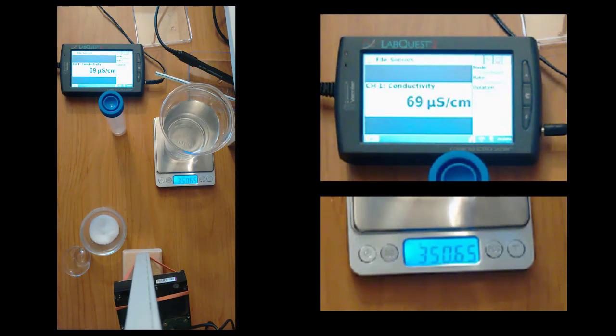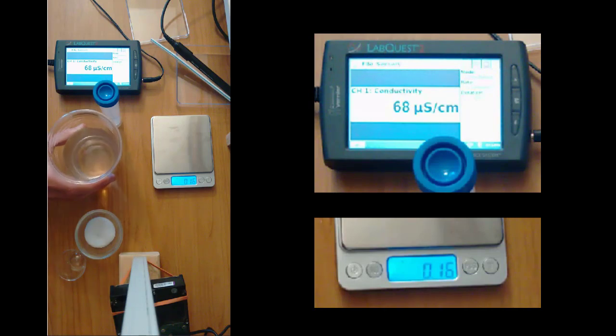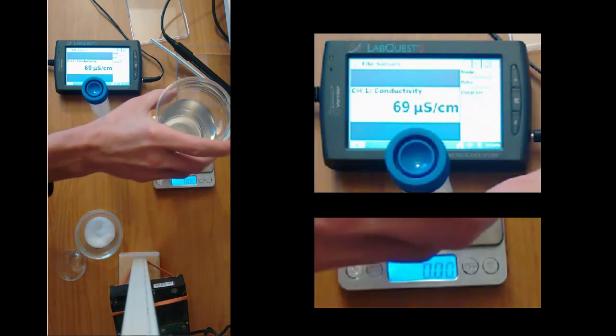Okay, that completes the data collection for the filtered tap water. We do have one more trial to do, and we're going to analyze a sample of distilled water as a control experiment. And for our last part of this experiment, we're going to be looking at distilled water. So this is my sample of distilled water. Again, I'm not going to talk too much during the experiment. Go through and collect the data, record the data that you think you need in order to analyze this, similar to the way we did the first trial.